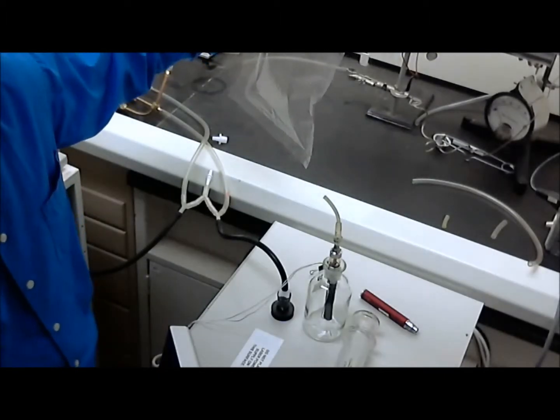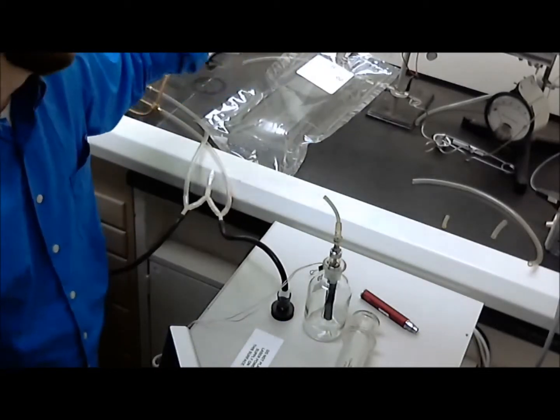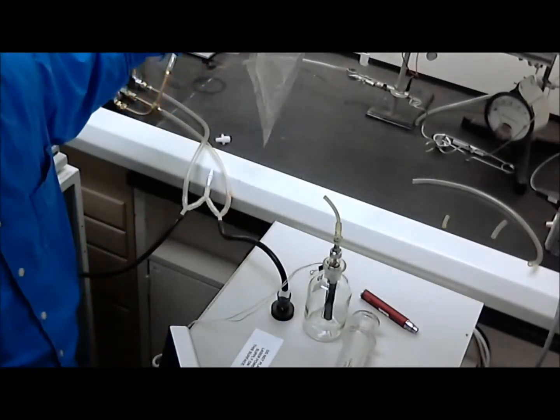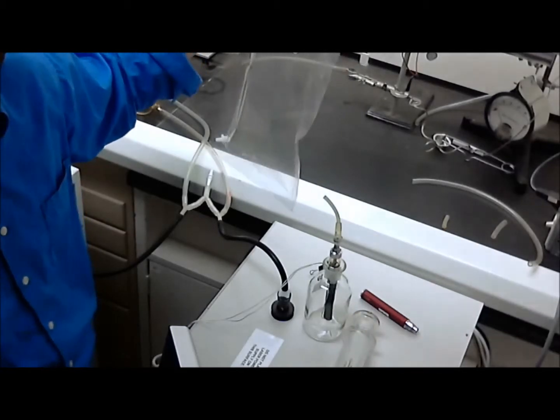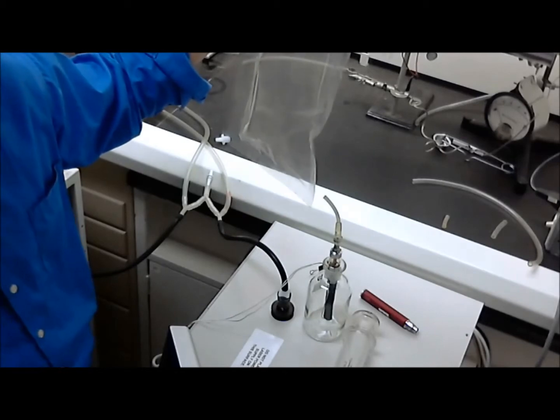We injected into a bag instead of a rigid vessel, as we had originally designed, because the volume of the bag could be depleted without changing the concentration inside the bag.